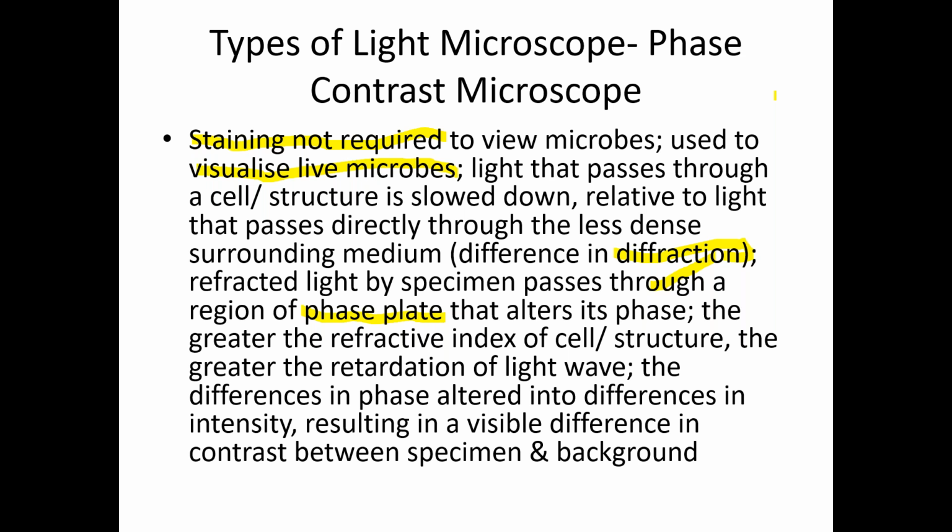Now, this difference in phase or speed of the light wave is converted into differences in intensity, which results in a visible difference in contrast between the specimen and the background. Contrast, you know what is contrast? Fine. Can anybody answer in the comment box what is contrast? Anybody? What is contrast?